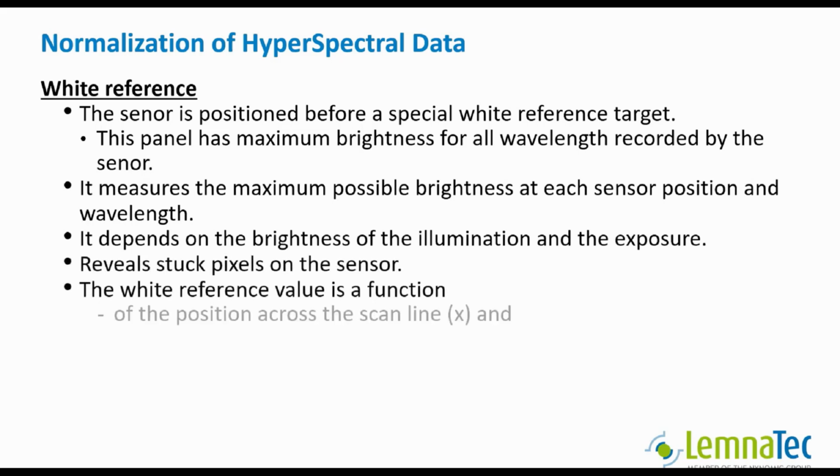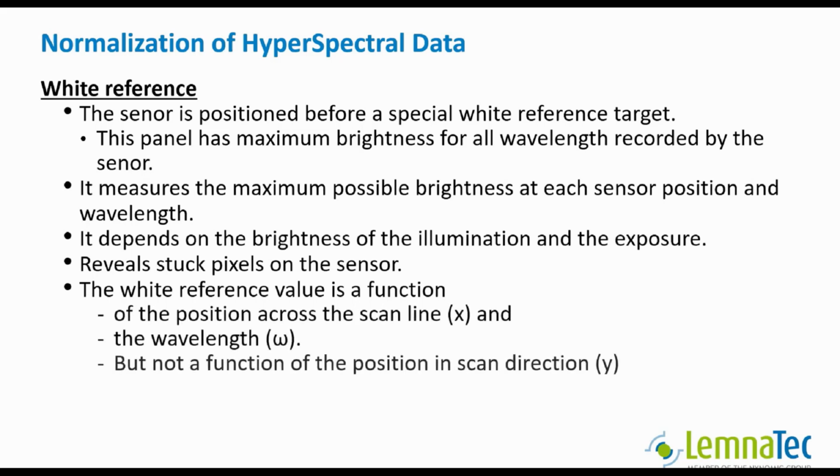The white reference is again a function of the position on the scan line X and the wavelength omega, but not of the position along the scan direction Y.